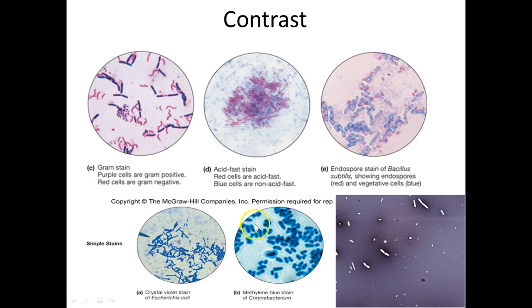In this case here, the bacteria are actually not dyed. You see the cells? Right here and right here and right here. The background is stained instead. This is a different type of stain. It's referred to as negative staining because it's almost like a picture negative, right? Where it's opposite than what you would see on the paper.